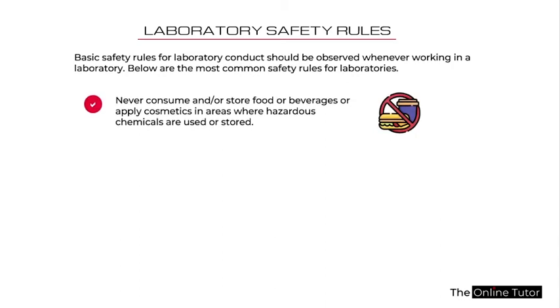Never consume or store food or beverages, or apply cosmetics, in areas where hazardous chemicals are being used. This is very self-explanatory. So don't eat in the lab. It's just that simple. Don't eat in the lab, because the chemicals around you make the air around you not safe for you. So eating in those conditions may be bad for you.